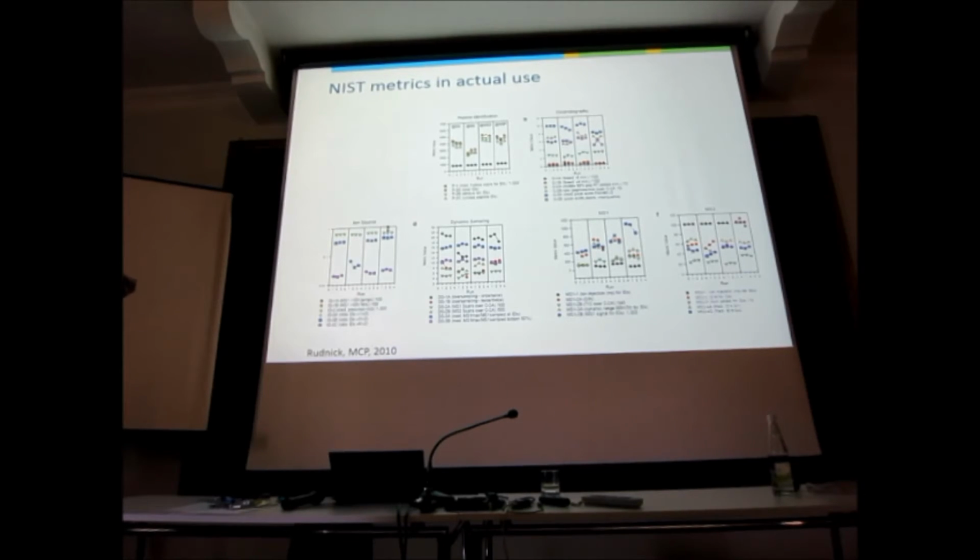So how many peptides do you identify? Ooh, these guys are not doing as well as most of the other guys. You see that? But they're consistent. Chromatography, nah, something is wrong, right? I should have listened to Mike. So here, ion source, aha. You see what's going on here?